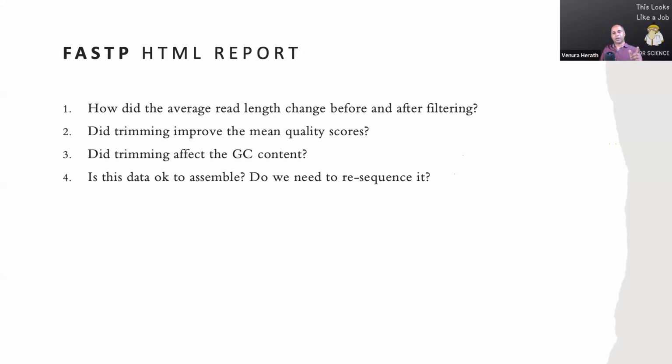Make sure it's there, then save it, then go back, and also check the top. Sometimes the tag unfiltered is selected, so you need to delete that from the tiny search bar on top. That may be the reason why the tags disappear, because the unfiltered ones were filtered out from filtered.